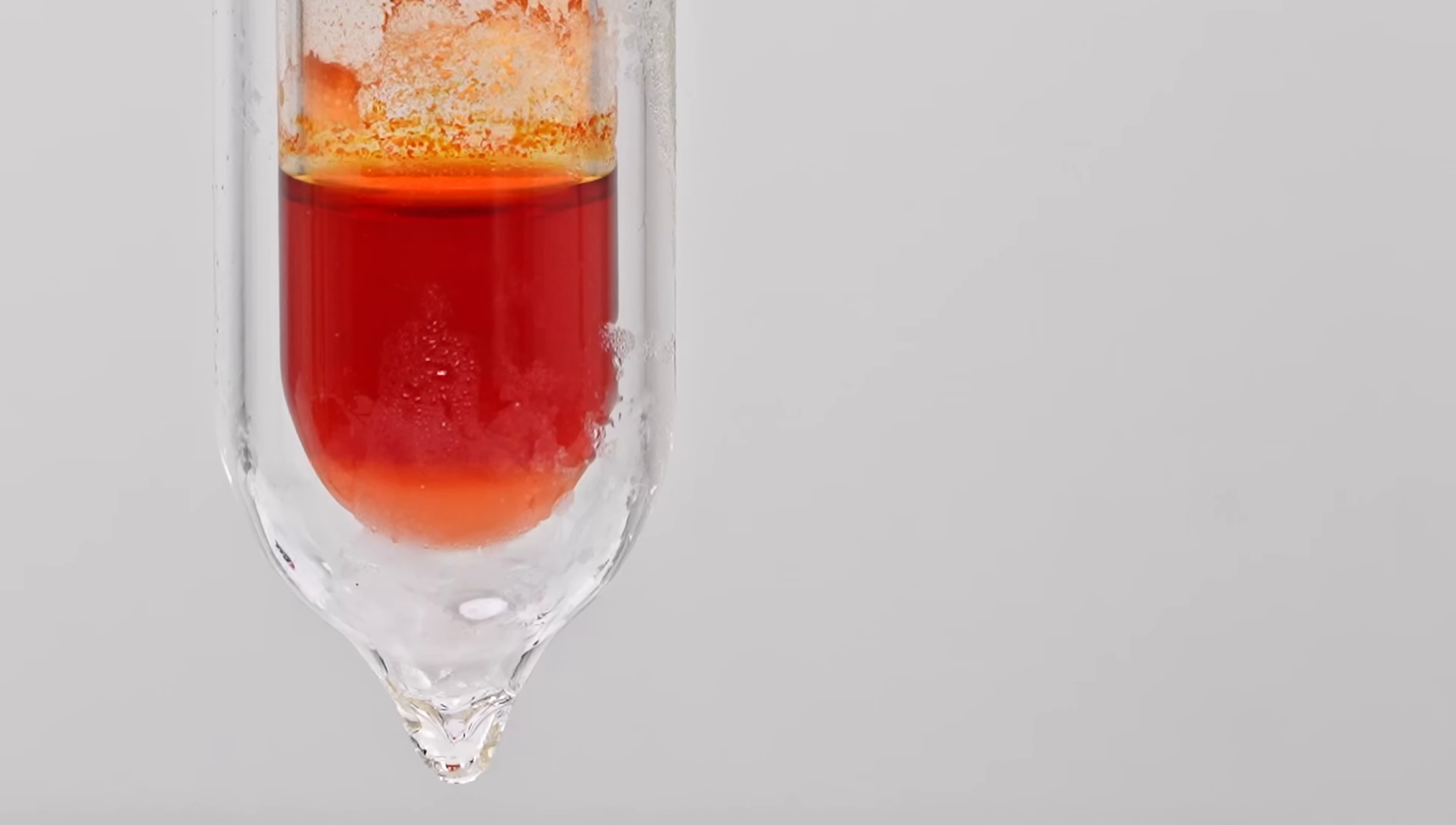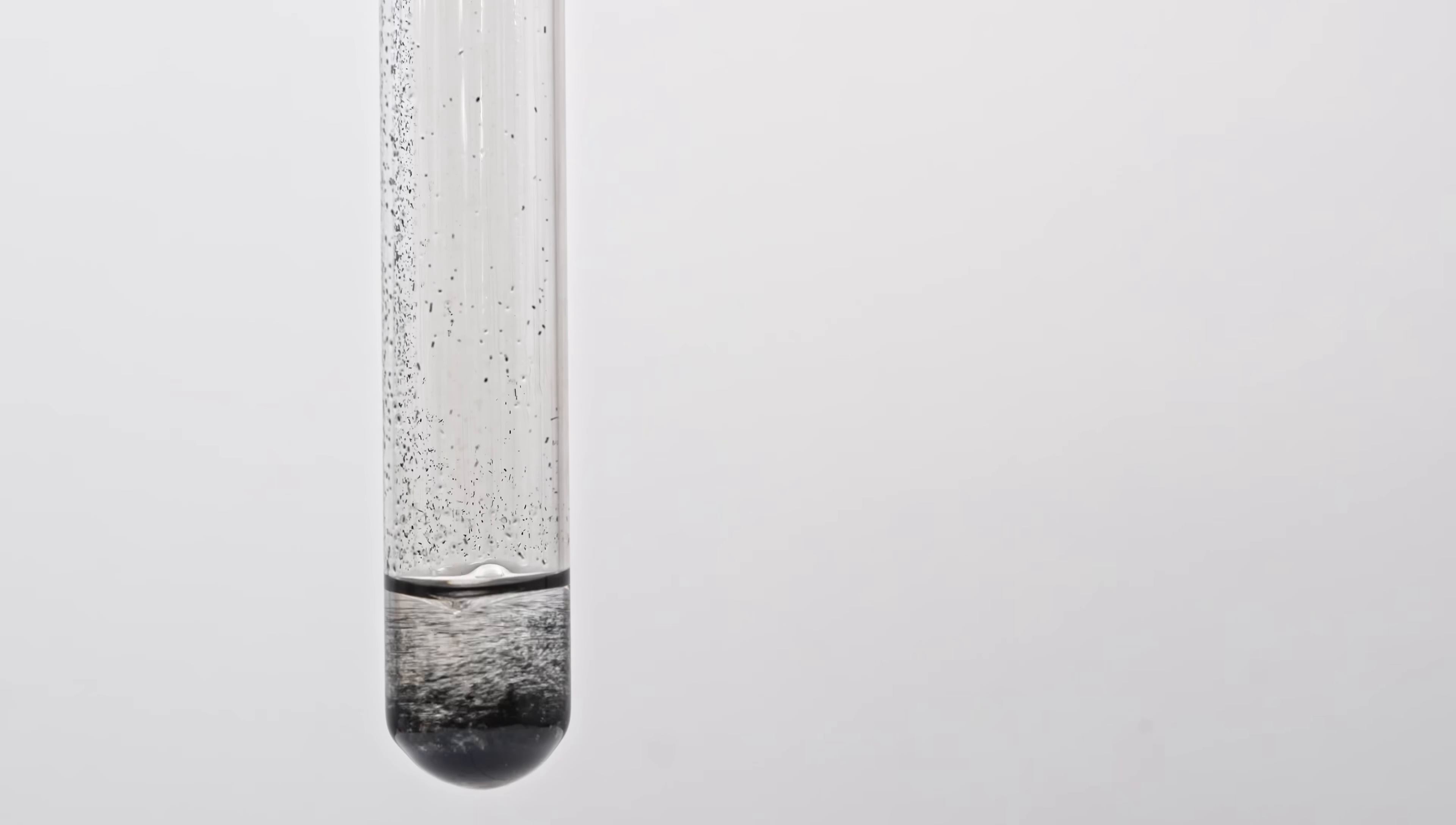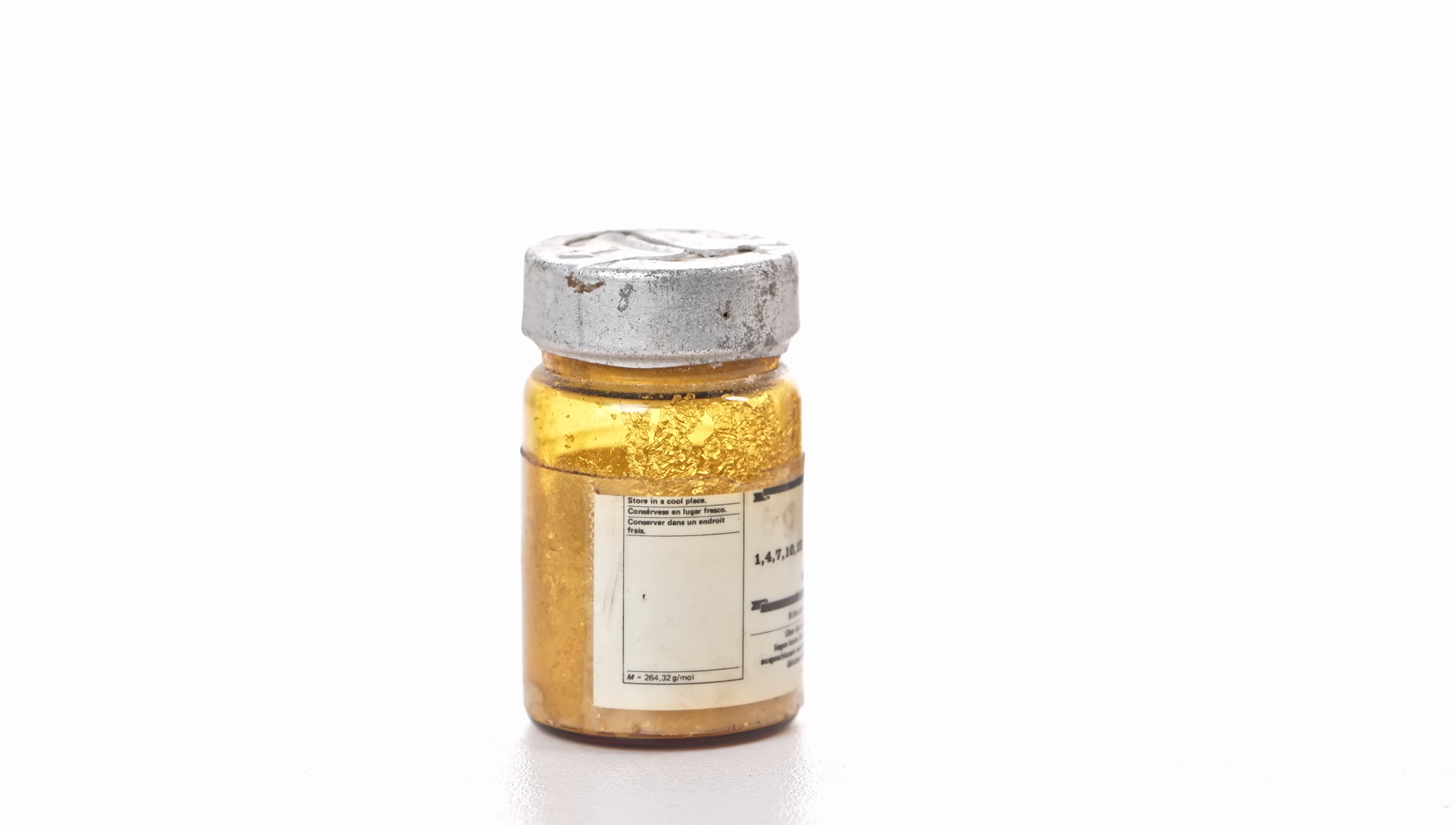This next test tube contains benzene, and now I'm adding some potassium permanganate to it. As you can see, nothing happens. That's because potassium permanganate is a polar ionic compound, while benzene is a non-polar solvent. The permanganate simply sinks without dissolving or reacting.